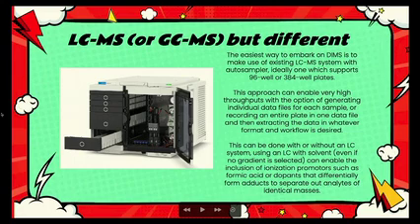Or you can start thinking about putting in some sort of dopant or promoting adduct formation to get a little bit of differential adduct formation that can give you a little bit of additional separation, without going to all the trouble of doing chromatography.